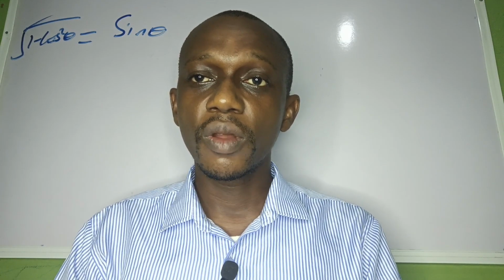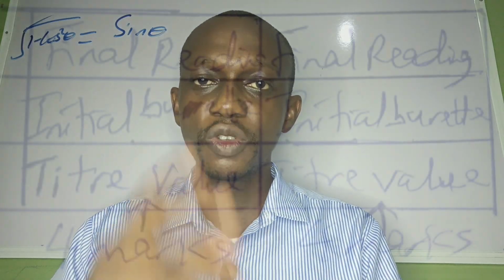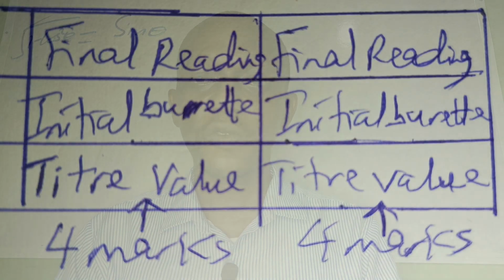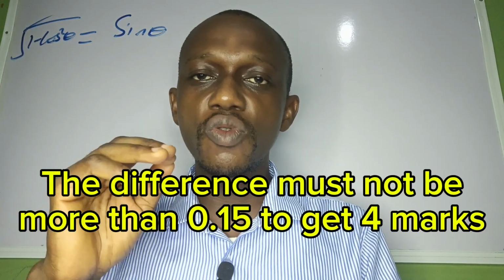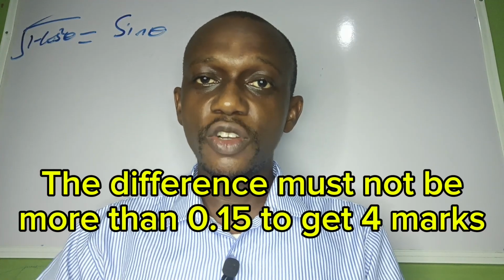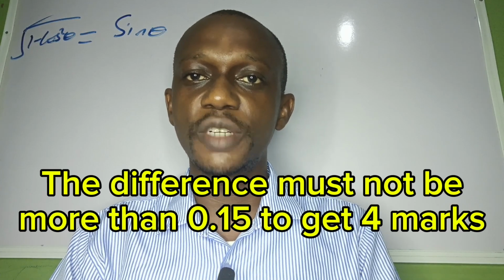I come again. So, if your titre value is to have a maximum mark, there are 4 marks for each titre value. You have to use 2 titre values for your averaging normally. There are 4 marks for each of them, so 4 marks for one, 4 marks for the other one, making 8 marks. Now, the first 4 marks, you might get 0 there. Why? Because it must be very similar to the value of your teacher. Because your teacher also performed the experiment, the titration, and your teacher will have a value which will be sent to WAEC. That is what WAEC will use in marking your own script.